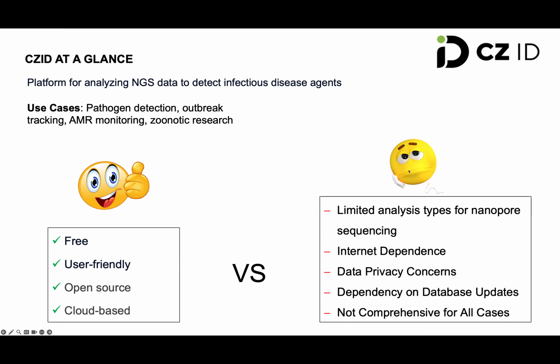And then you have a dependency on database updates. So you are really depending on the platform itself, that it uses the recent updates. If they don't update it frequently, you won't have the latest databases which are used for your analysis.